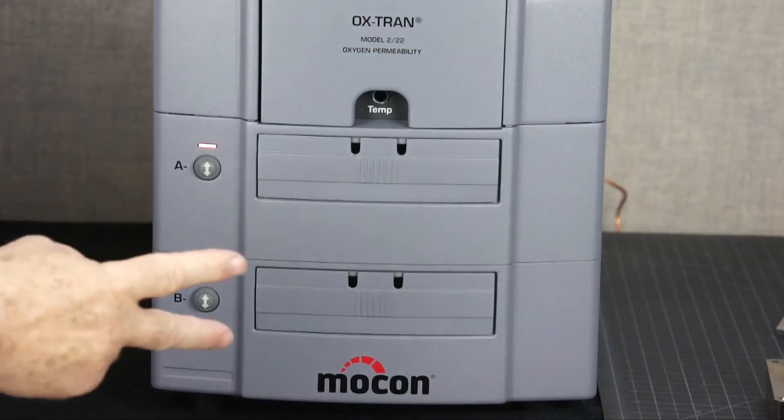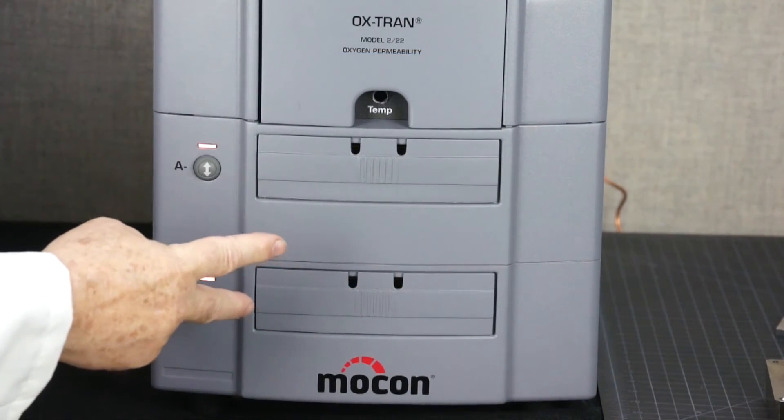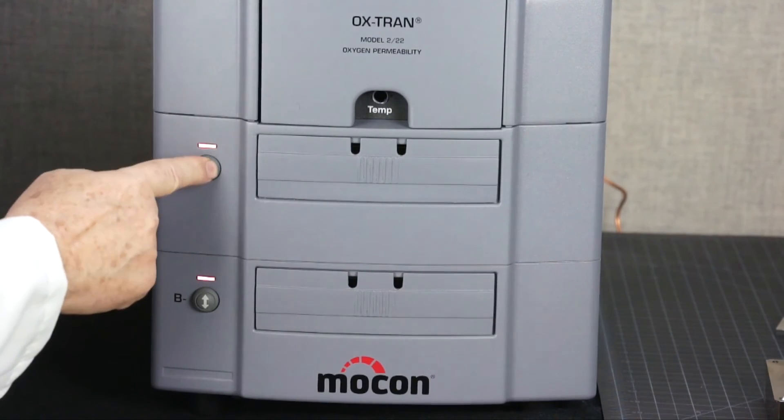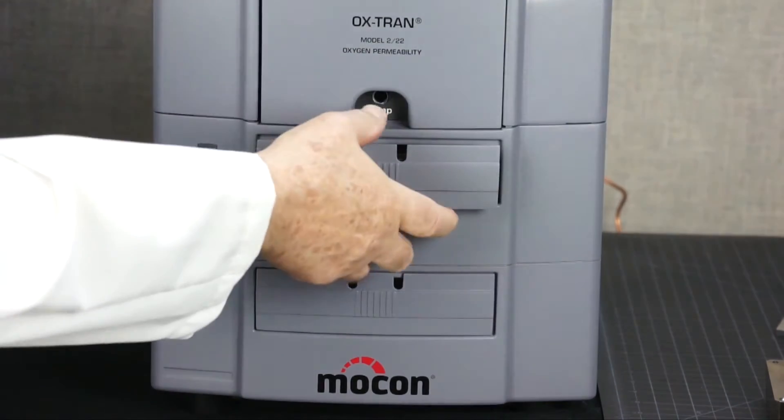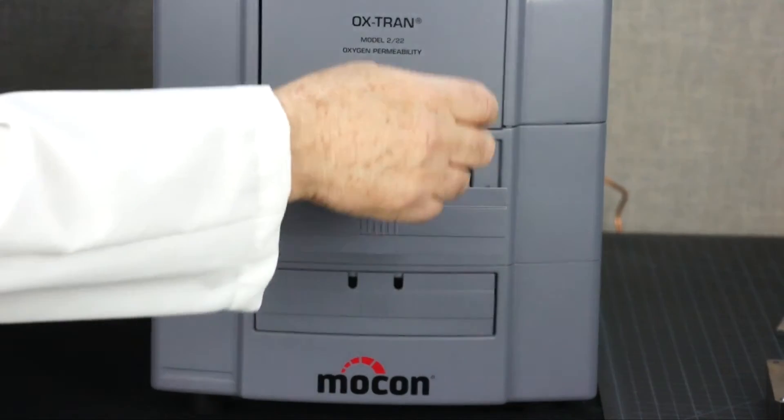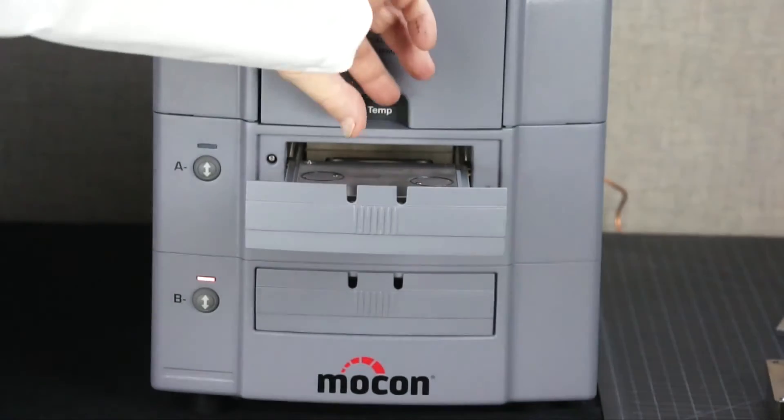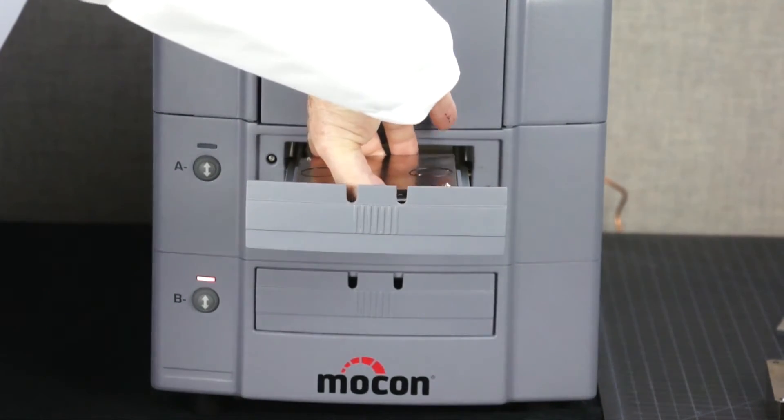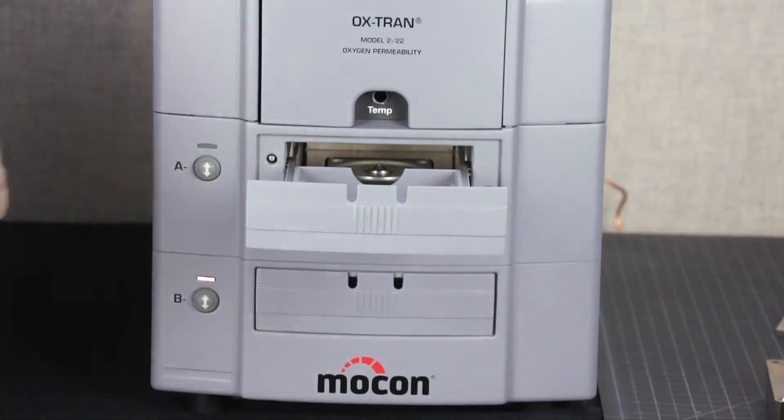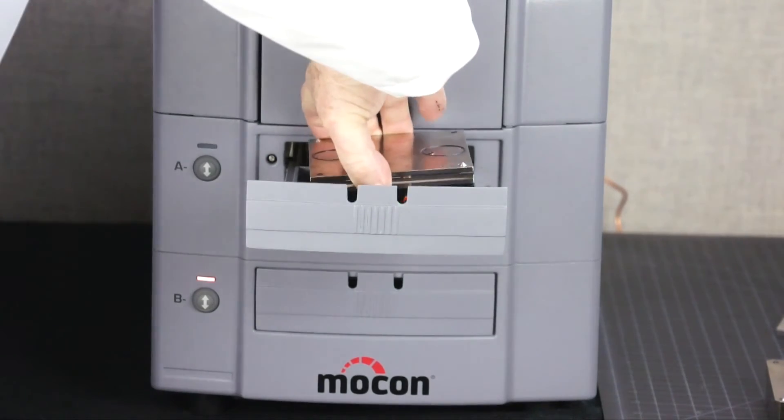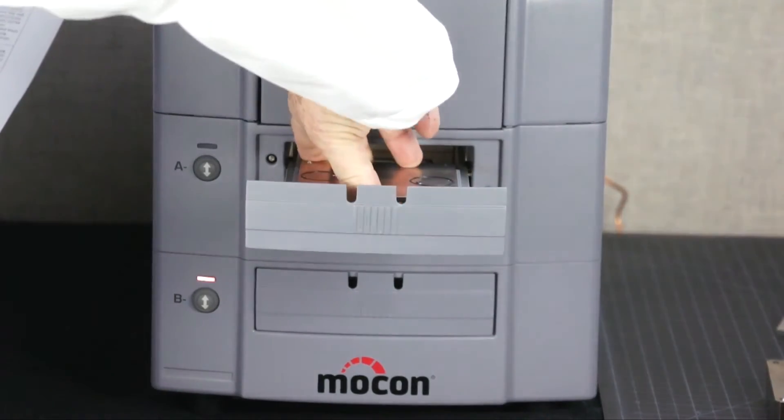The two horizontal cell drawers slide out at the touch of a button and allow you to remove the cell for easy placement of the film while the cell is on the bench. The cells clamp pneumatically at the touch of a button, eliminating any chance of repetitive strain injuries and ensuring consistent clamping pressure every time.